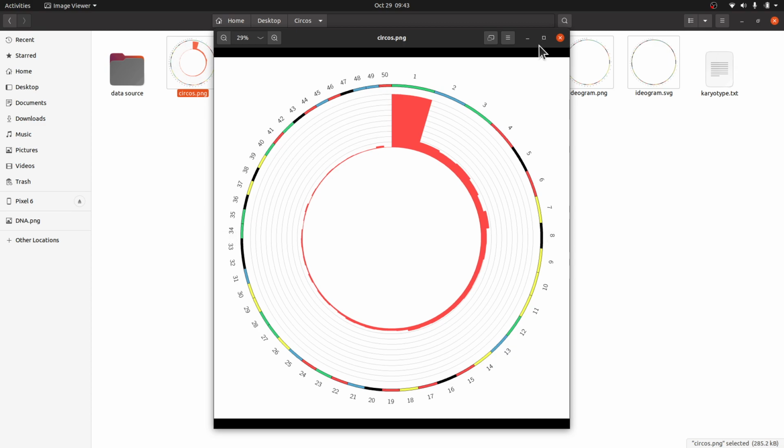You should also take note that the interpretation of the plot should be tailored towards what you want to display or the information you want to carry out there. And so with interpretation, it's up to you to decide how you want it to be done. At least for this one, it's representing number of reads that's mapped to contig. So you can do the comparison. For example, here it's obvious based on the visualization that the number of reads mapped to contig one is higher than all the others. So if let's say you were interested in a particular contig or particular sequence, then this will help you to identify those patterns.